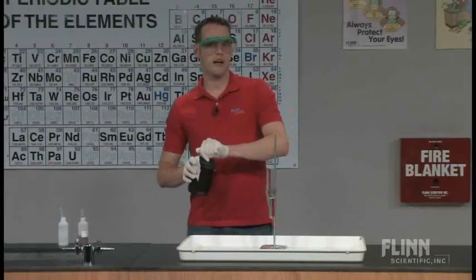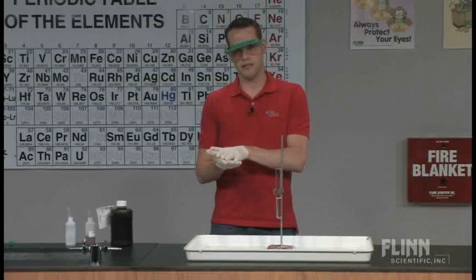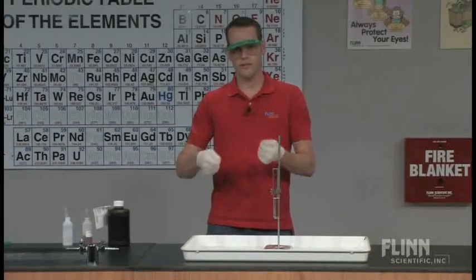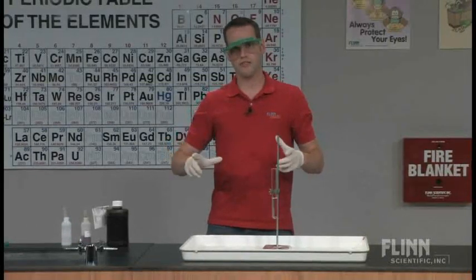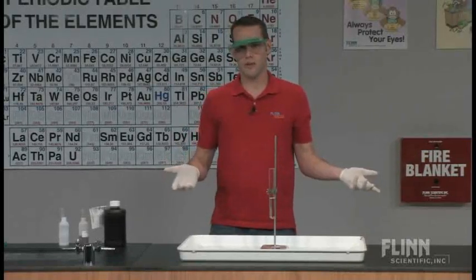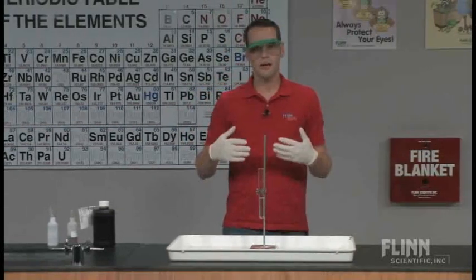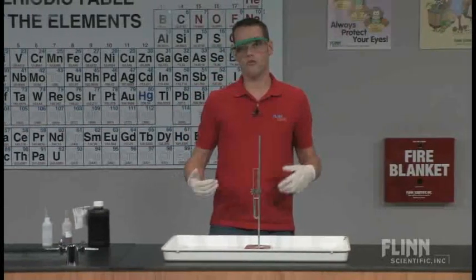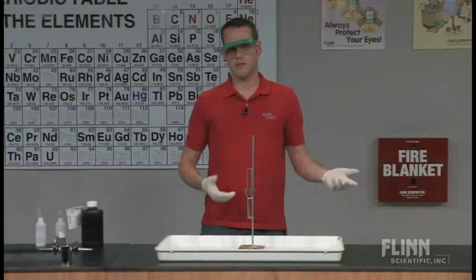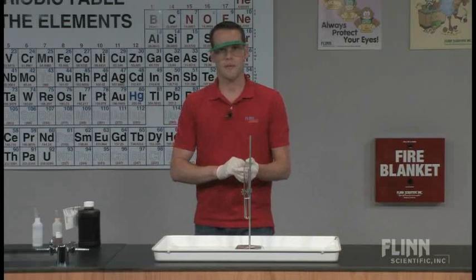In my school, we have a photography lab and the photography teacher periodically has to get rid of the dishes that they use for developing the portraits and the prints after they've illuminated the light on them. She gave me her old splash trays and they're chemically inert substances. So I have lots of splash trays that I can use in my classroom. So talk to your photo teacher if you have one in your building and get them to just give you the old trays whenever they get rid of them.